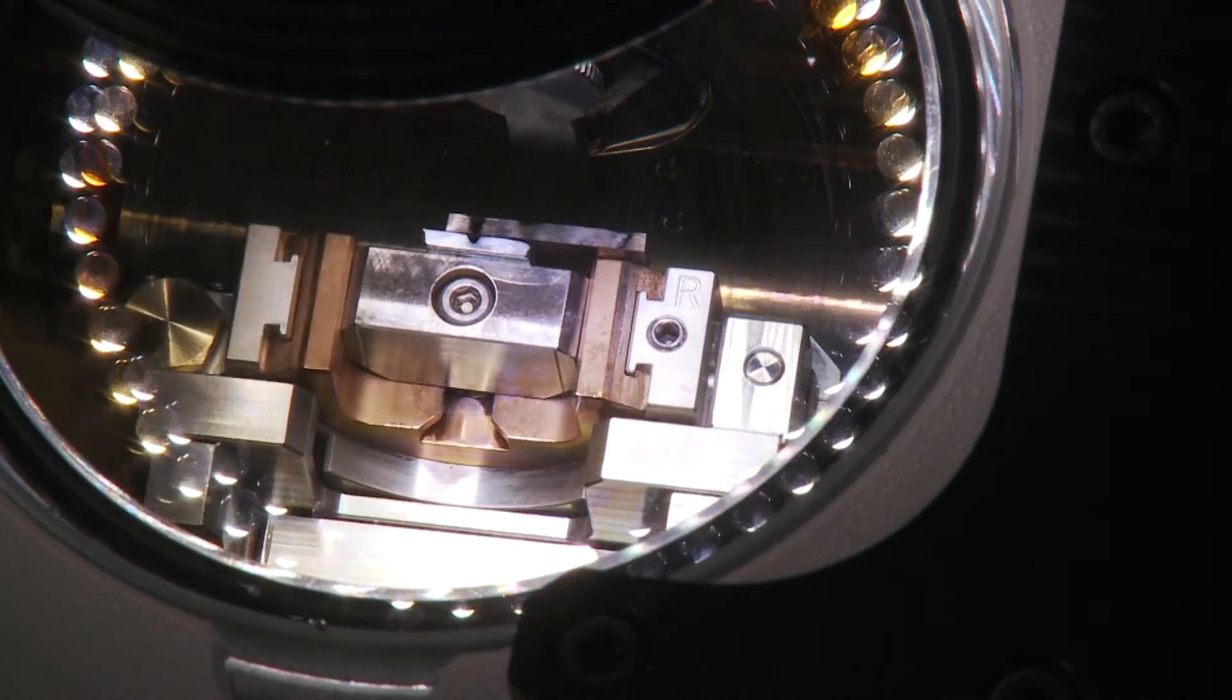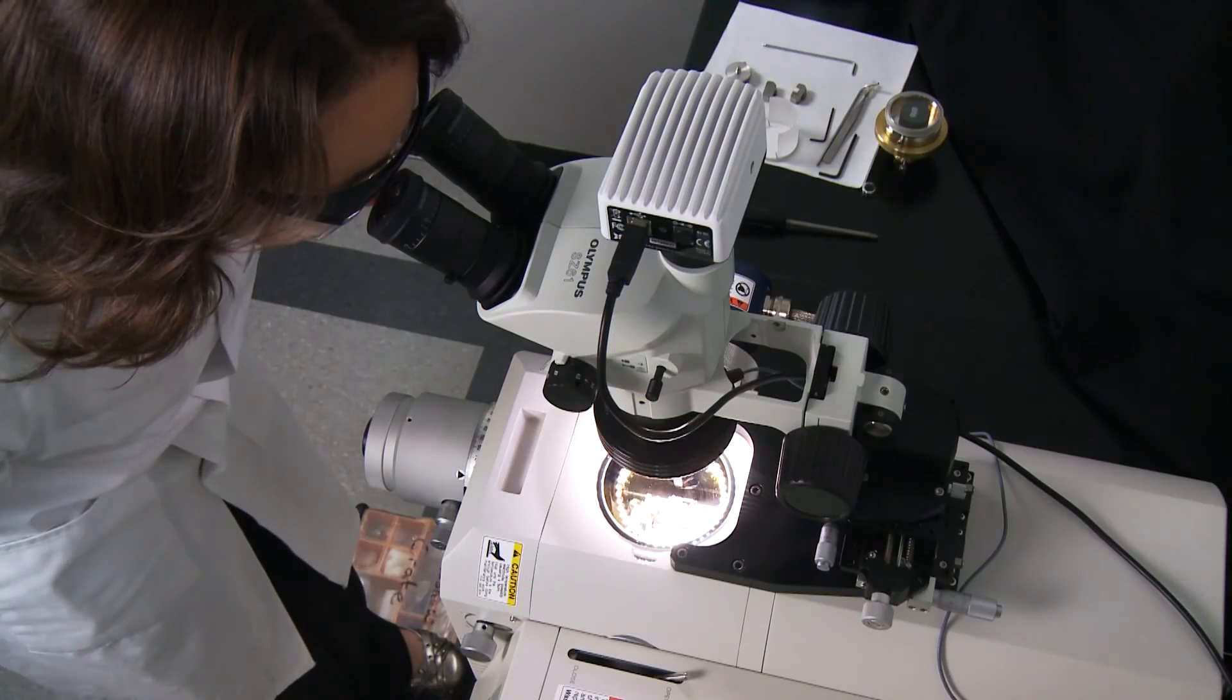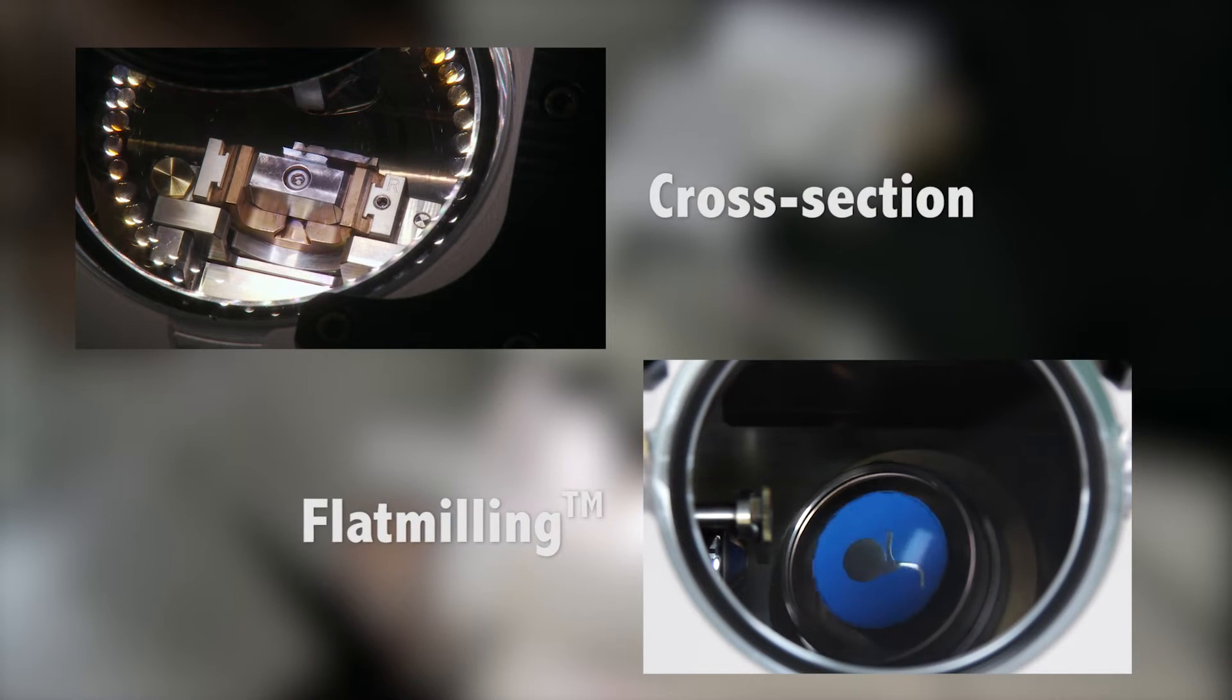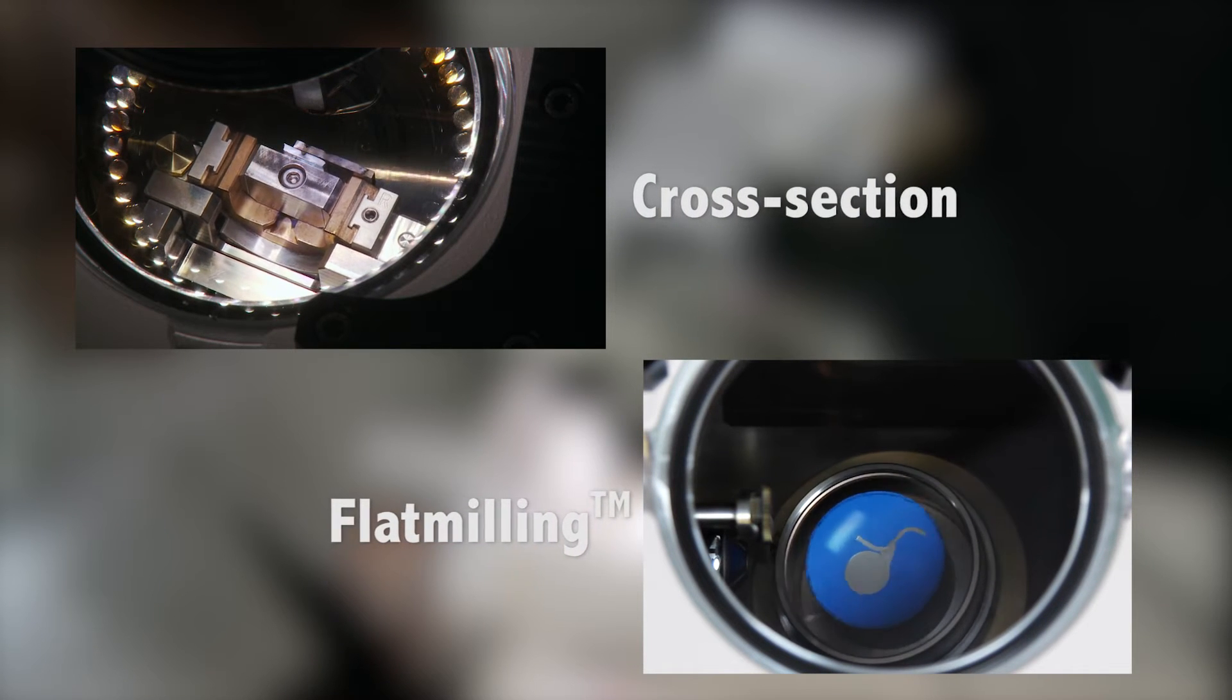The new Argon Ion Gun design of the Ion 4000 Plus allows it to reduce cross-section processing time by as much as 66% with an industry-leading guaranteed high milling rate on every system.